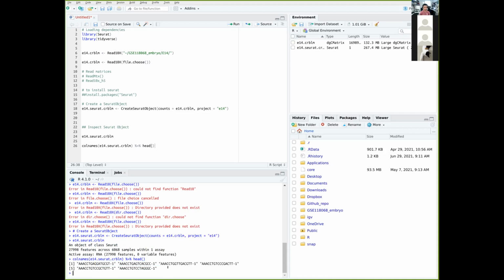And you might think that this is weird. Why are the names in terms of nucleotide bases? The reason is because this is exactly how we identify the cells. The cells are barcoded when you perform single-cell RNA-seq.